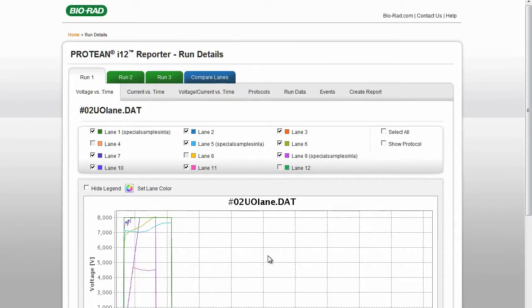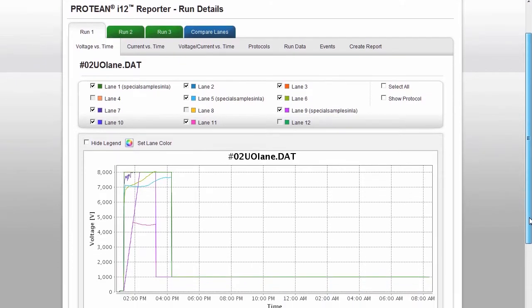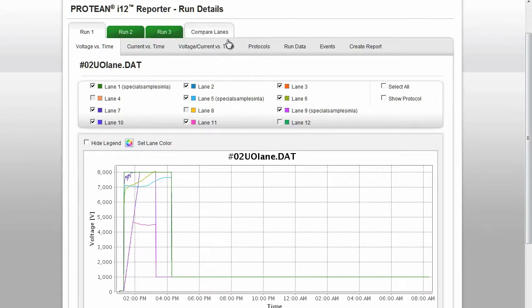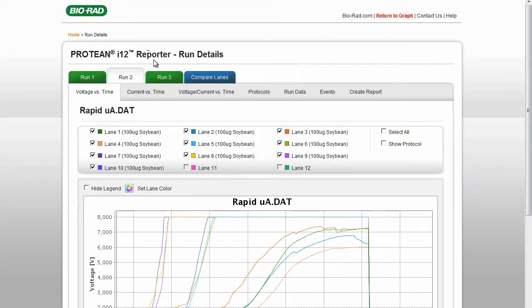The data appear under tabs across the top of the page. If multiple data files are uploaded, the Compare Lanes tab also appears. Clicking on the tabs shows you the data for the runs you have uploaded. Under the tabs, your data are now displayed in different formats.